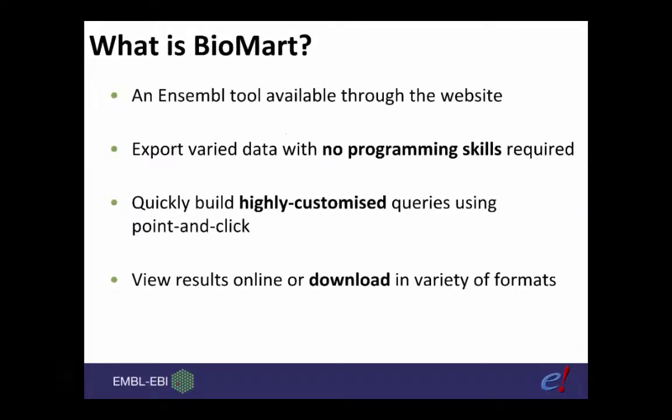This is what we call an Ensembl tool, which is available through the website. It's also available as an R package if people prefer to use R. It enables you to export varied data without any programming skills required. So it's a highly customizable point-and-click interface for you to download bulk amounts of data. And you're able to view the results online or download these in a variety of formats as well.